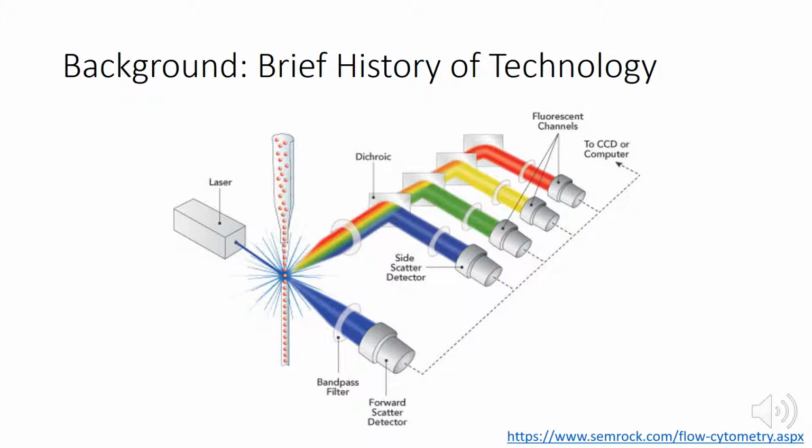The authors of this paper designed a virtual core flow cytometer, or VCFC, which detects the position of particles that pass near the center of the laser. It does not require a special sheath fluid and could be applicable in various settings and fields of research.